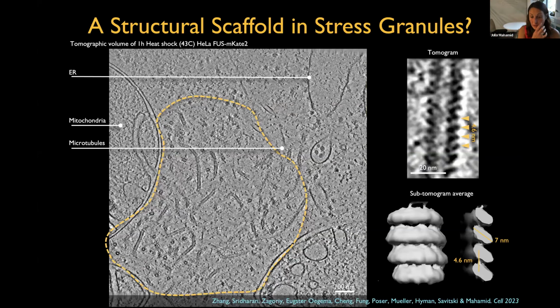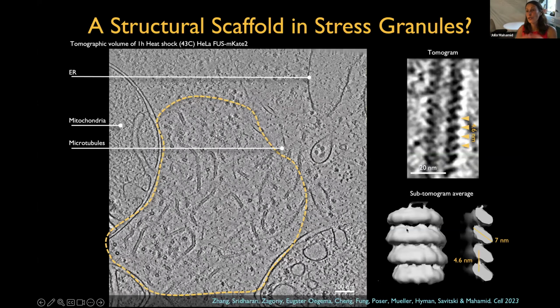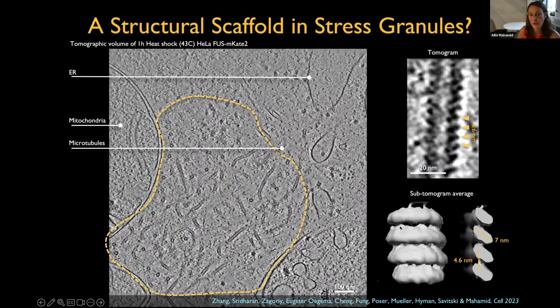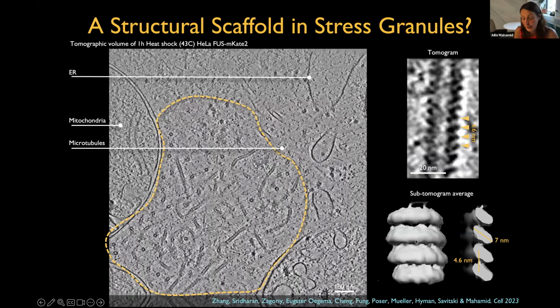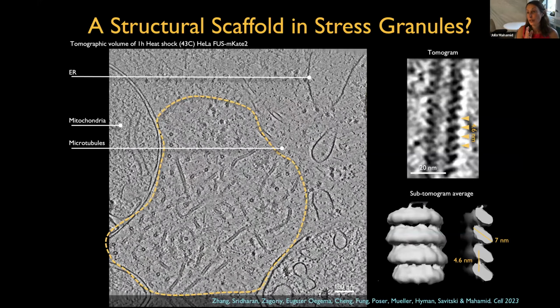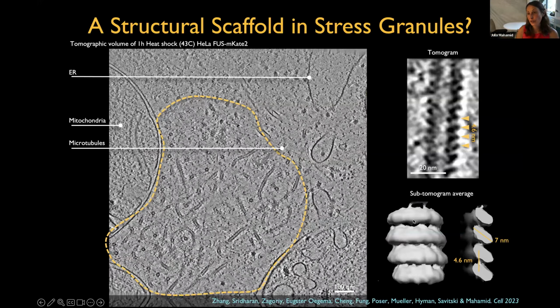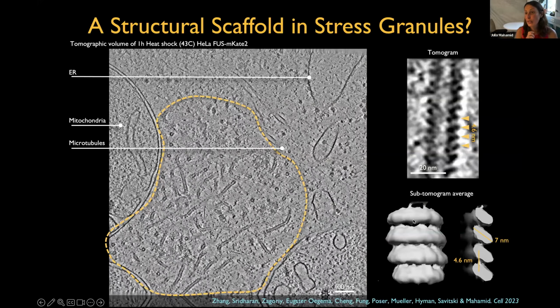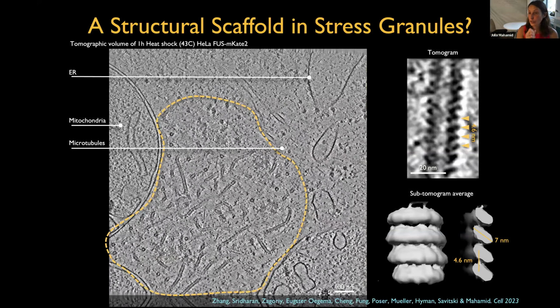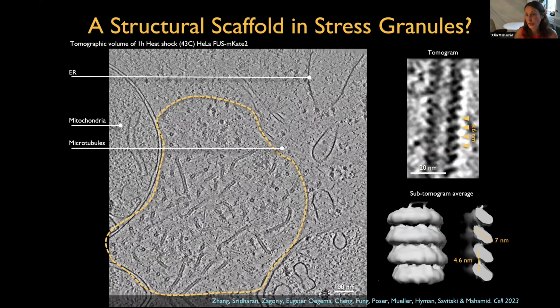And so we were very intrigued to follow up this discovery and try to identify which out of the hundreds of human proteins that we know segregate into stress granules would give rise to these assemblies. And so we went down the path of generating cellular fractionations, and we were actually able to obtain quite pure fractions that we could visualize using negative staining CryoEM, and really confirm that we can obtain purified fractions of these helical assemblies.